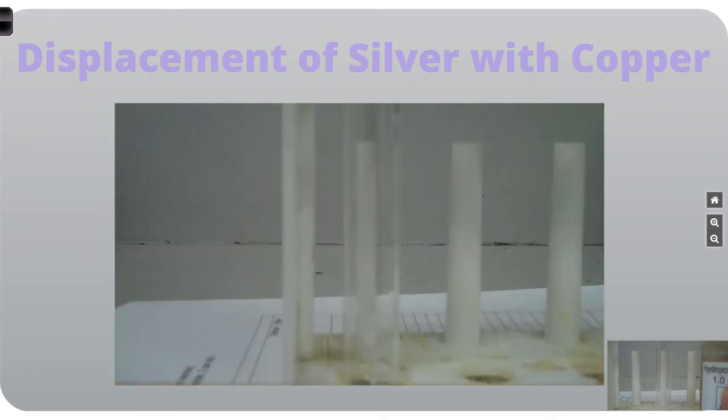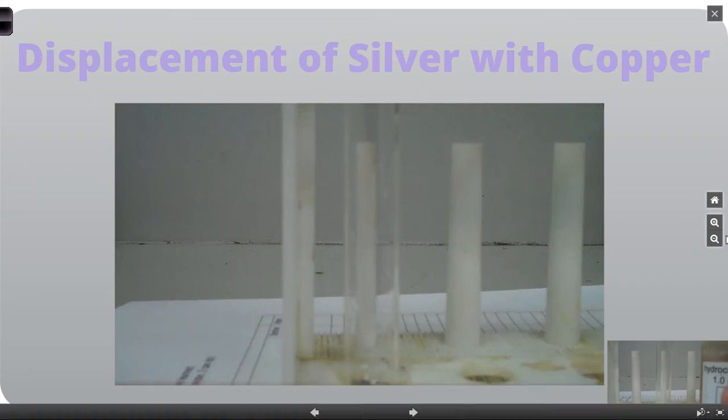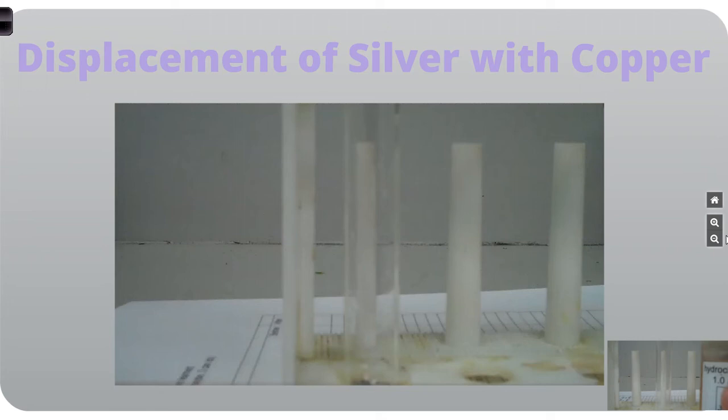So what's happening is the copper is a solid. The silver is actually in solution. So it's reacted with nitrate. It's formed a compound, silver nitrate, and that compound can dissolve in water. However, when we add copper, the silver and the copper swap places so that we get copper nitrate in the solution, in the liquid, and silver comes out as the solid on its own that you can actually see in the tube. Now lots of students ask me, can you make silver this way and make lots of money? Well, unfortunately everybody knows that silver nitrate contains silver. So it's not the cheapest of chemicals, and it's not an effective way to actually make any money.